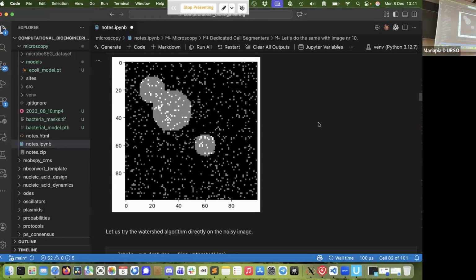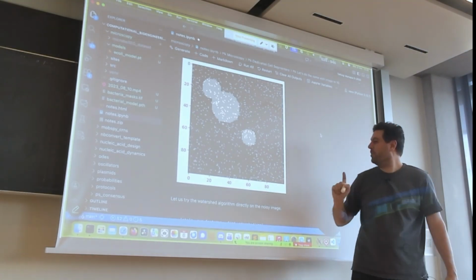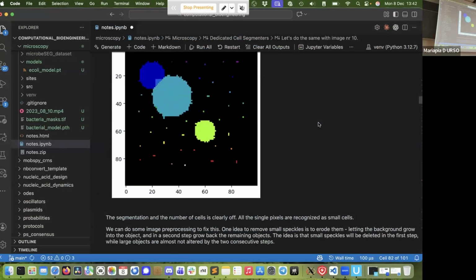I mean, that's perhaps a bit very noisy, but let's get started right away. And if you do watershedding here, what will happen? Probably every such pixel will fill up with water, right? So let's try. And here we go.